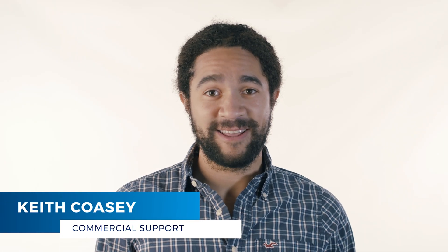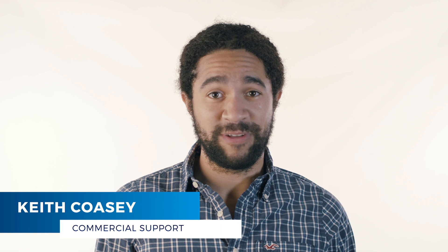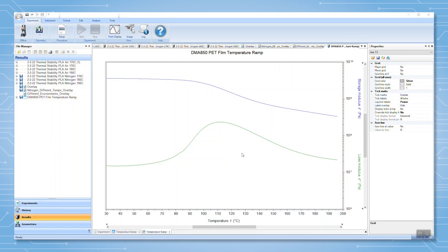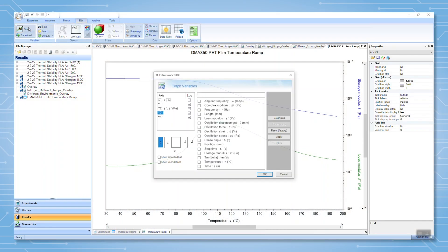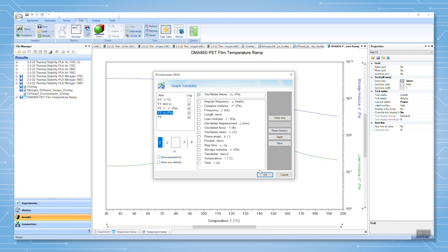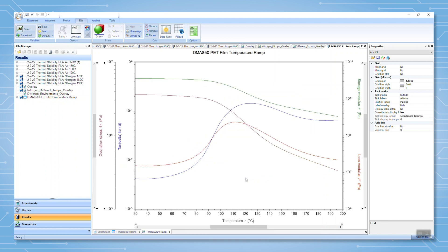Hello and welcome to another TA Tech Tip. In this Tech Tip, I would like to show you how to create user-defined variables in the TRIOS software. While there are a number of variables predefined in TRIOS, the user may want to define custom scalar sample properties and/or create variables defined by a customized equation. Doing so greatly expands advanced analysis capabilities in TRIOS and allows the user to perform custom analysis for reports, all within the TRIOS workflow.